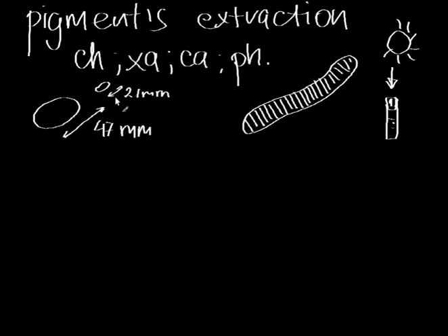After growing, you filter the biomass through the filter. You have all these tiny strings of cells on the filter. You cannot see them, but you can see the green color on the filter, which is actually chlorophyll.